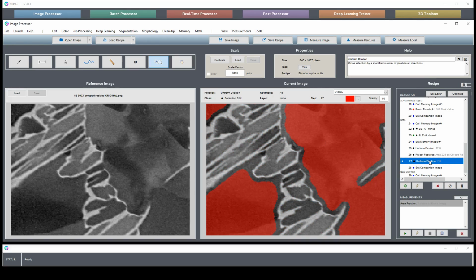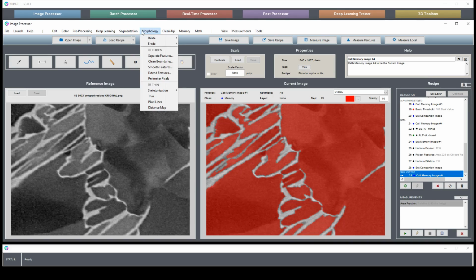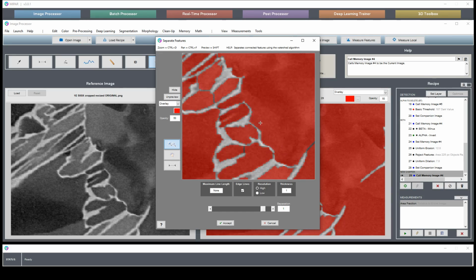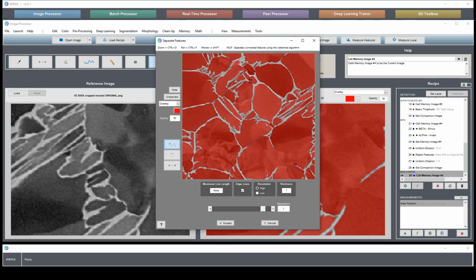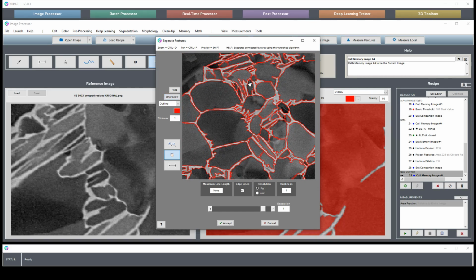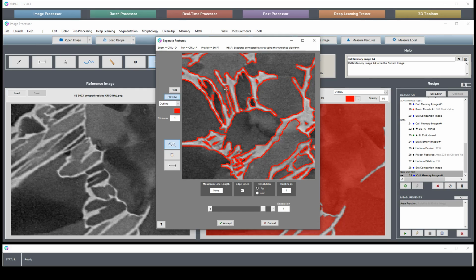Because if I'm going to do, say, a keep mutual features between this and this, these need to be separate features. So we'll make all these cuts with a watershed function. Okay, and it's not perfect, but it's pretty close. If we go to outline view to see if we can see these cuts being made a little more accurately. All right, these cuts are being made, but I'm more interested in cuts through here. That needs to be cut.